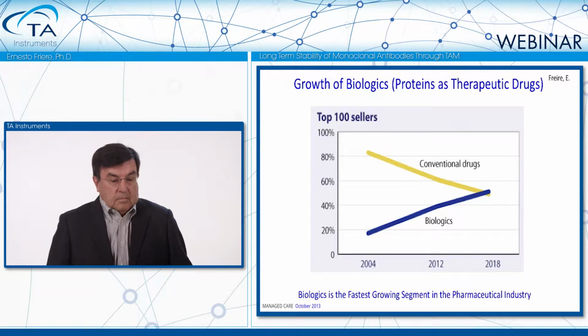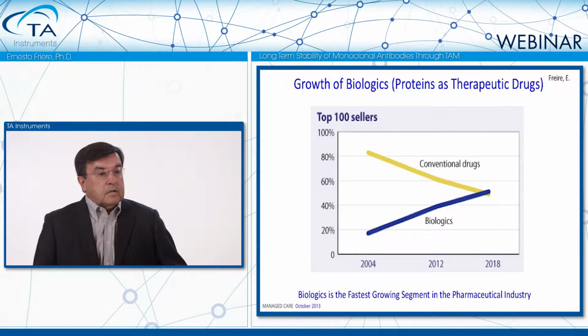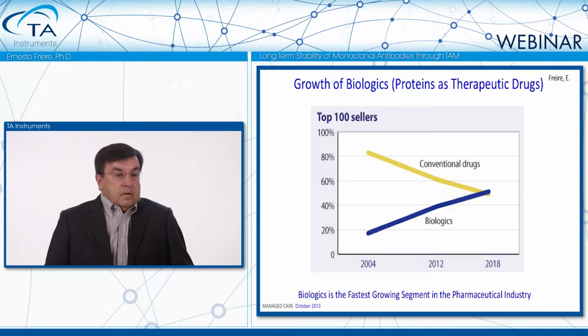Ernesto? Thanks, Colette. So today I'm going to talk about the use of a new technology, the TAM isothermal calorimetry, on the analysis of long-term stability of monoclonal antibodies. As many of you know, biologics is the fastest growing segment in the pharmaceutical industry. It is expected that by 2018, about half of the drugs that are sold will be proteins, and the other half the conventional drugs.